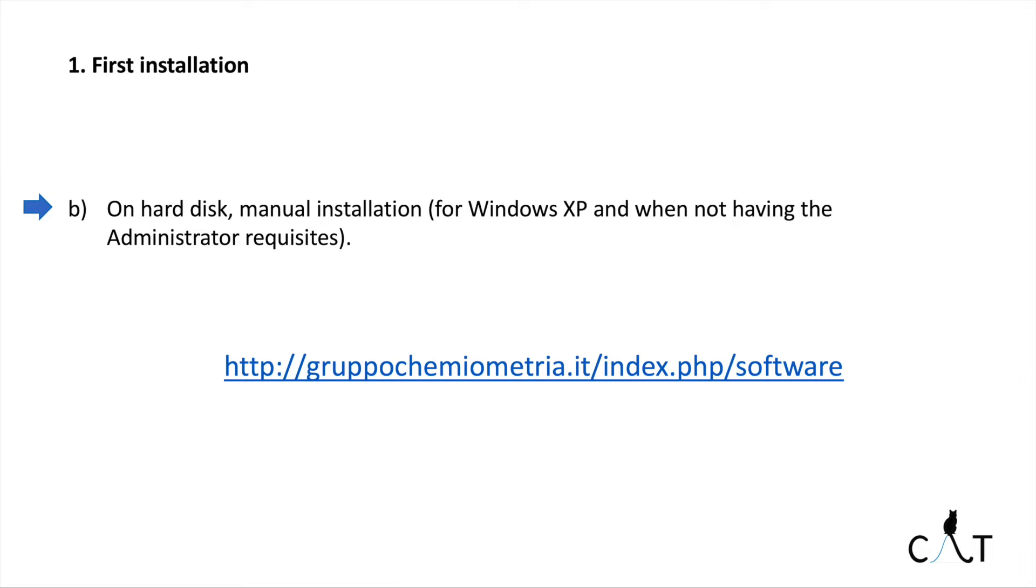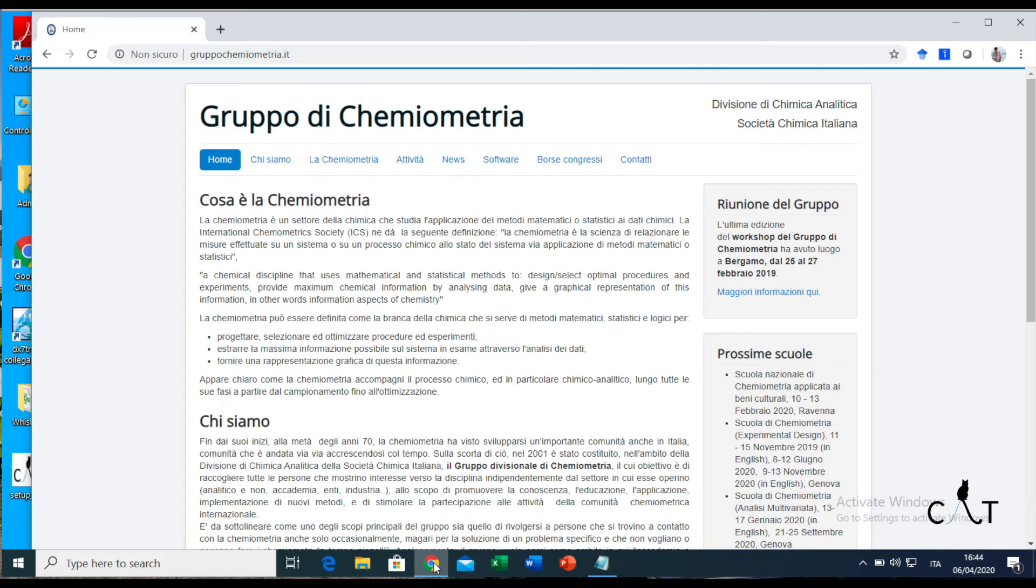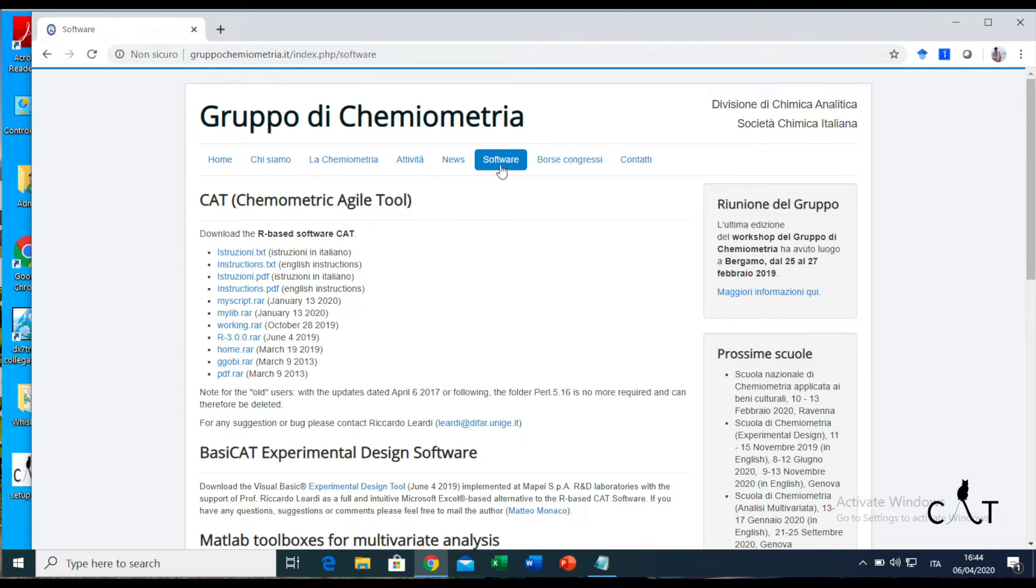In particular, in this tutorial we will see the manual installation, so let's go to the website. Here we are on the website. We click on software and here we can see the folders, and we click on instructions.